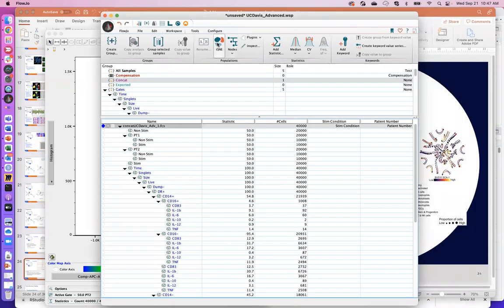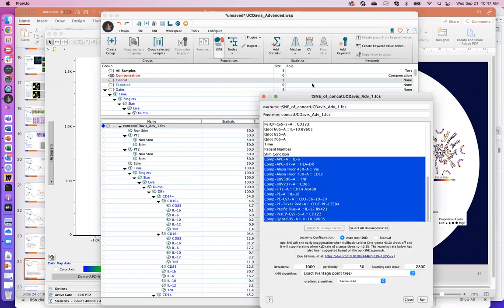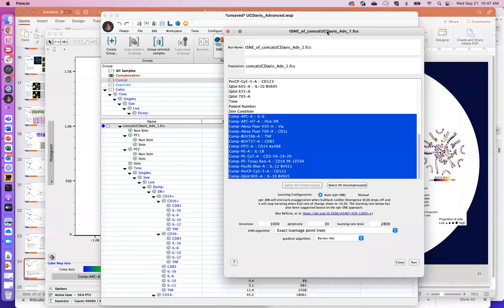So I'm going to use t-SNE, but again, you could use UMAP or some of the other maps, right? So for example, you have UMAP here, there's TriMap, I have another one called PacMap. UMAP is a little bit slow in comparison to t-SNE, so that's why I choose t-SNE here, in addition to showing me all the granular differences between populations. So I will show you the t-SNE plot here. Maybe if we have time, we can do a UMAP as well.